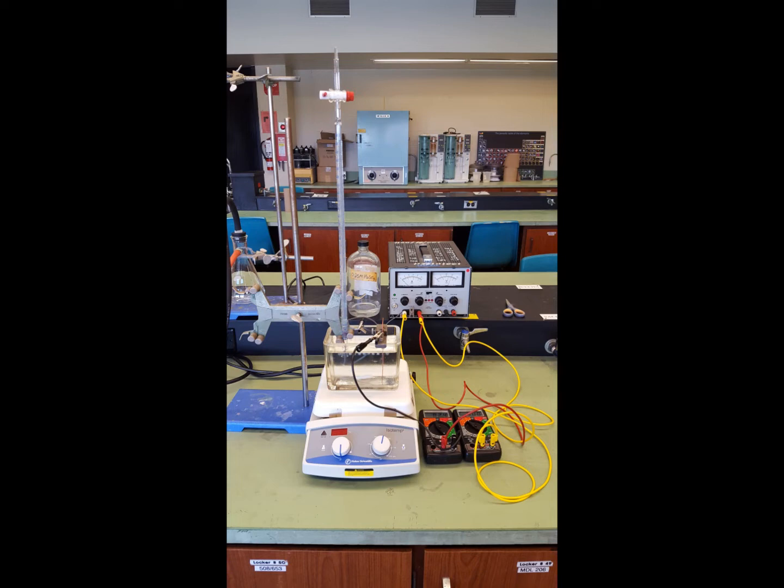Since the copper plate is connected to the positive terminal, that means oxidation will occur at the copper plate. That is, electrons will be taken from the plate into the power supply, and that means that copper plate is the anode. Oxidation will occur there, and copper metal from the surface of the plate will be oxidized, producing copper 2 ion, which goes into solution. Now we won't produce enough copper 2 ion such that you can visibly see the solution turning blue, but if we ran this long enough you would.